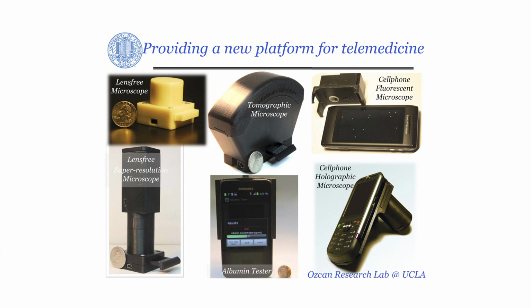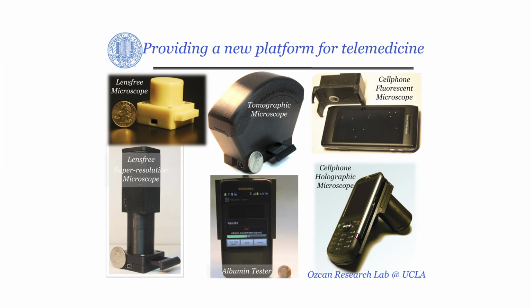If you do not want to modify your cell phone, we're looking at standalone devices that are powered through USB and that create a very lightweight and compact microscope that you can use for extreme wide field imaging. Besides microscopic imaging, there are other designs where you can use the cell phone as a detector, as a sensor.